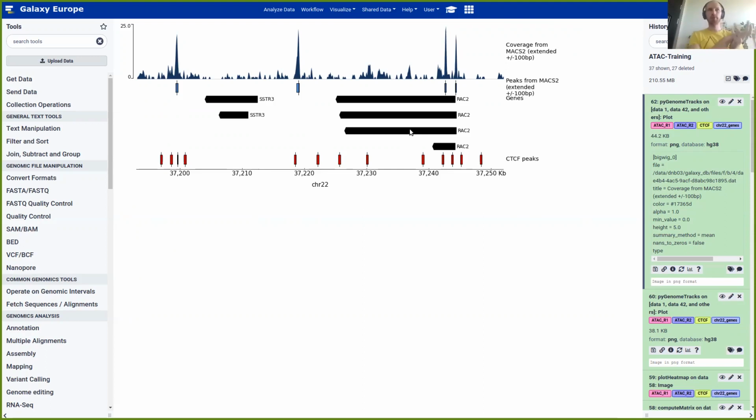I also mentioned beforehand that pyGenomeTracks is kind of a genome browser. I have to correct myself there also. That's not true. We see here a certain window, so it's not an interactive tool, so to say. So you cannot simply move around here. It's just this window. So that's why we see this certain window here, and we select this certain window. However, Galaxy has some genome browsers available, which you can search for.